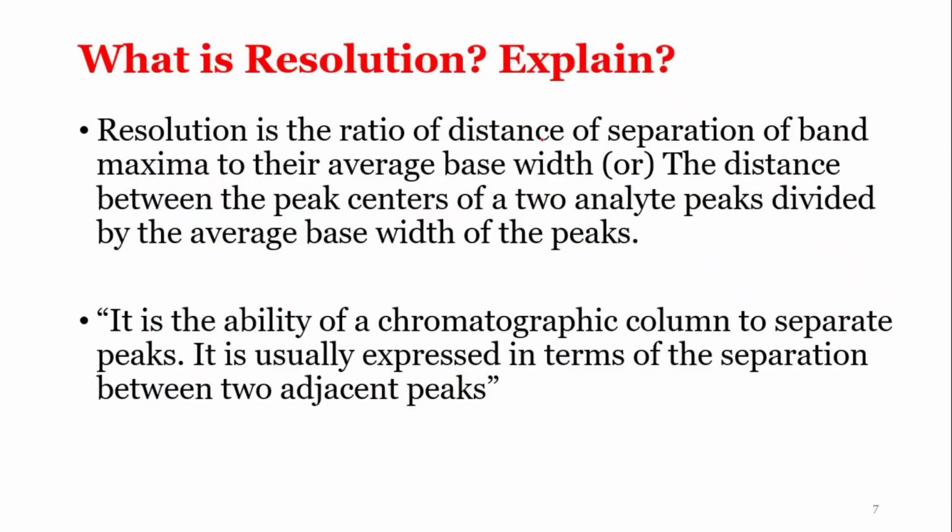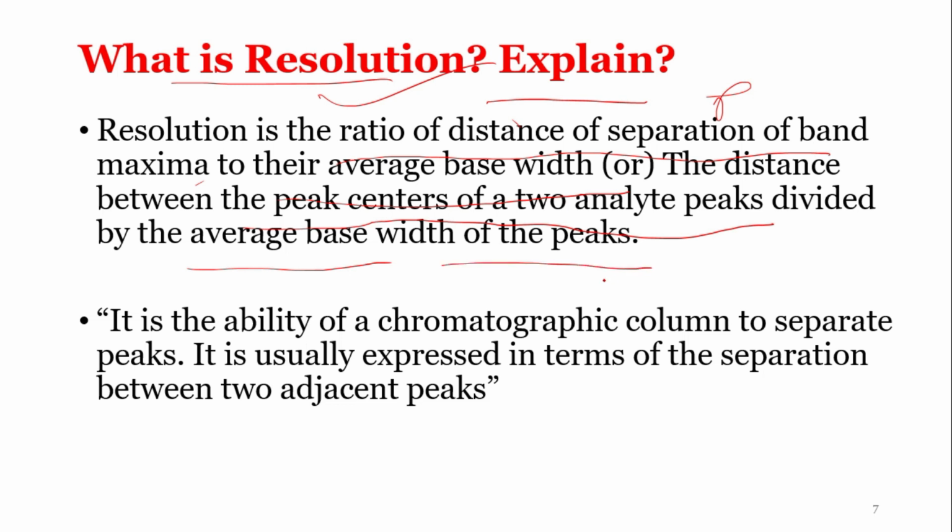What is resolution? Explain. This is an important question, and you should also know as a pharmacist what is meant by resolution. You should try to understand the basics. Resolution is the ratio of distance of separation of band maxima to their average base width, or the distance between two peak centers of two analyte peaks divided by the average base width of the peaks. I will show you a diagram and I will explain you there. That will be very clear to you.